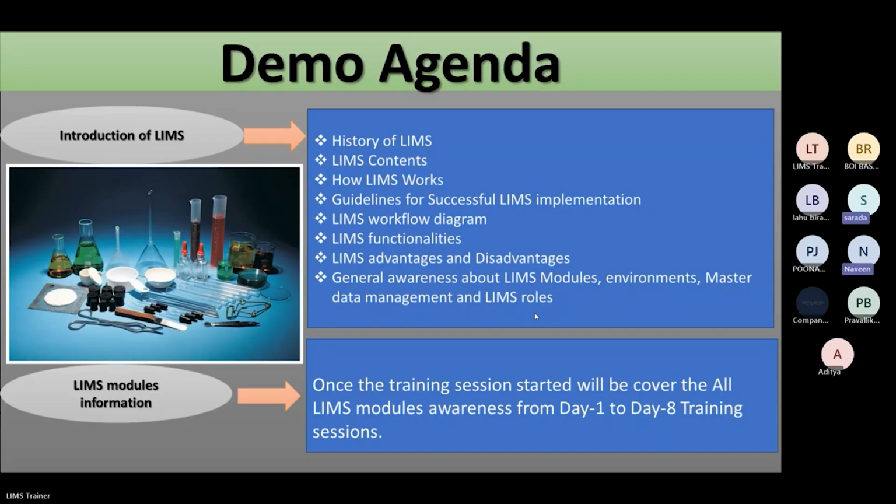Do you give any practical exposure for us once you give the LIMS training? Okay, see, here we consider one Labware LIMS software. So it's not possible to share the actual software or the actual login, because that is not feasible.